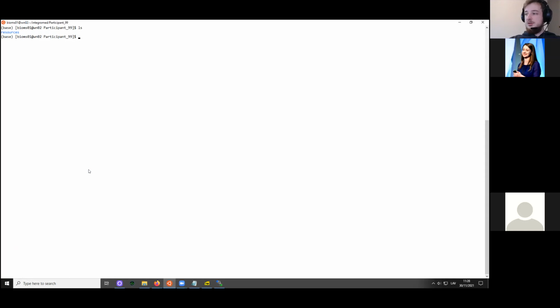So the first thing we're going to do is the read quality evaluation with a program called FastQC. But before that, we're going to create the results directory and also a directory for this FastQC output. So we're going to do mkdir -p, which allows us to create directories within directories, so directories and subdirectories.